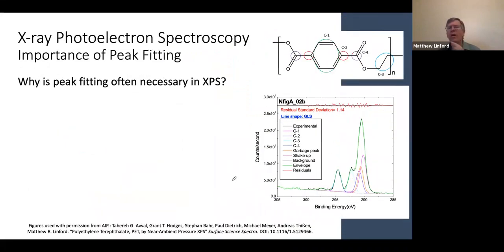So what all of this means, and this would be a topic for a more complete course, is that in a material like PET, polyethylene terephthalate, and I believe also Mylar, for example, which is biaxially oriented, just kind of rolled PET. So again, this shows up all over the place.